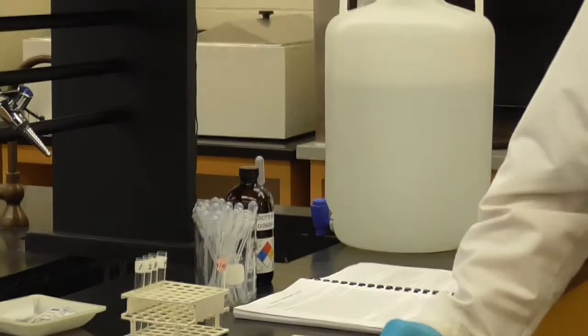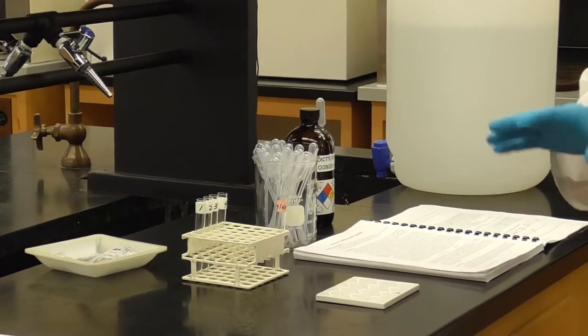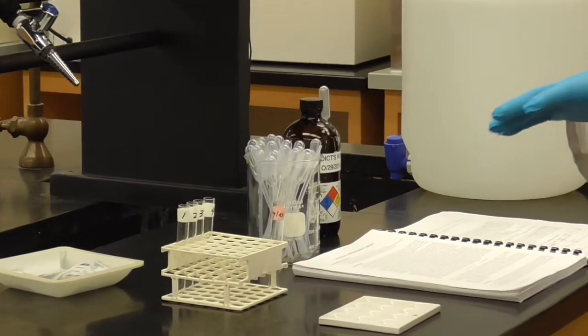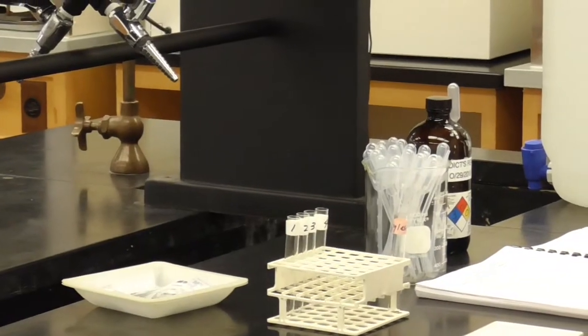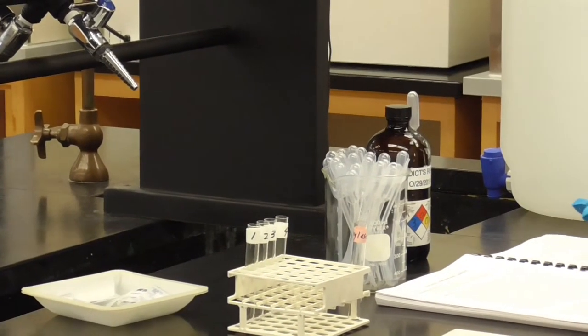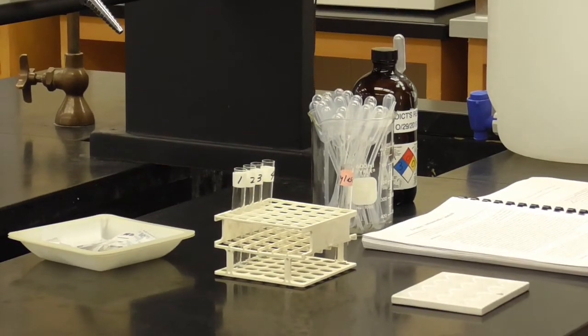Okay, part B. We've got our baths at different temperatures ready. We've got our solutions ready. Part B will begin our investigation by looking at concentration, but now, not of the starch, concentration of the enzyme. So if you add a little bit of enzyme, if you add a little more, a little more, how does that affect the rate?